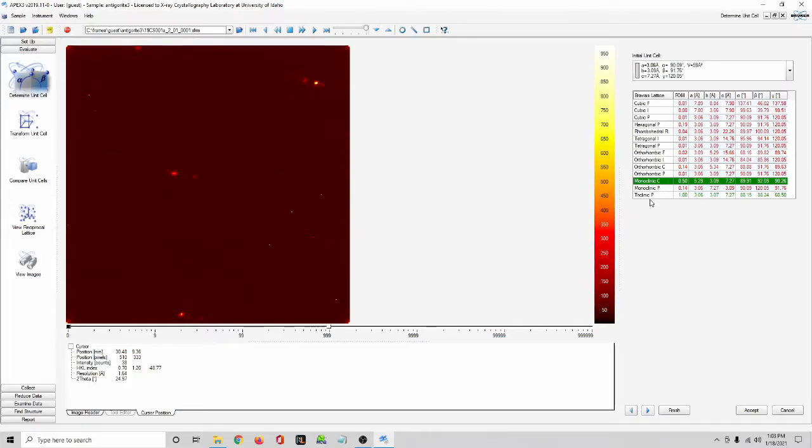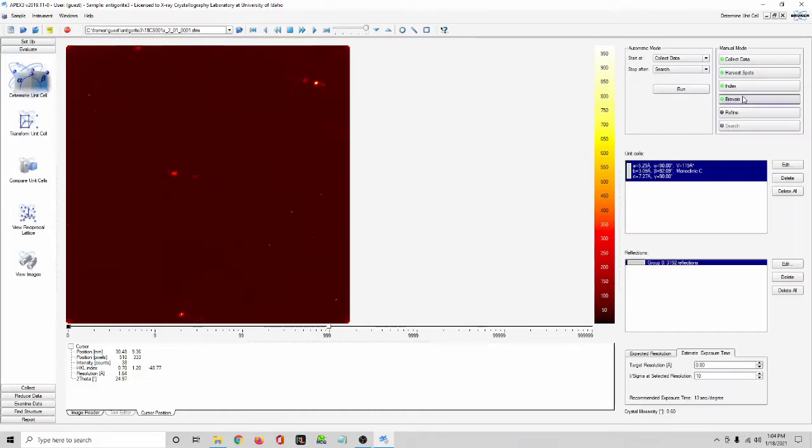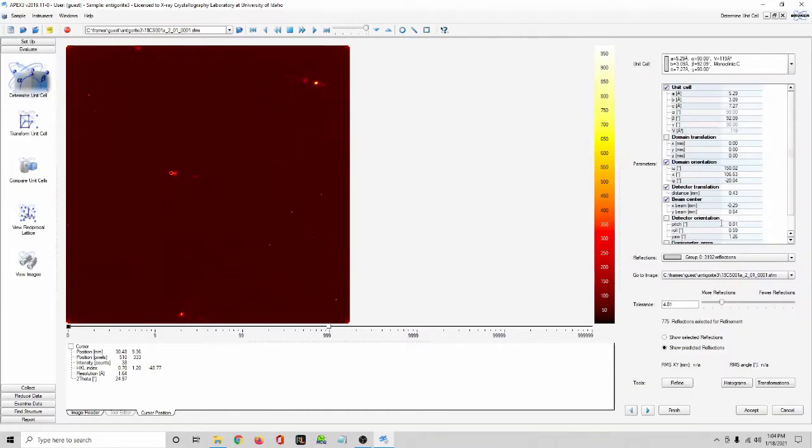Okay, this is the right Bravais lattice, at least. I don't think the B-axis is correct, for a few reasons. You wouldn't normally be able to tell at this stage if you didn't know the structure. The B-axis here is actually supposed to be triple this, which you can modify later on here if you want. But we'll see the repercussions of that later. So I'm just going to pretend like I didn't know that this was supposed to be 9 angstroms.